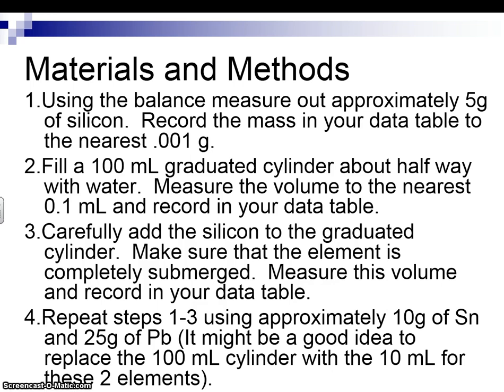Once you have completed doing all the measurements for one type of metal, then you can go up and collect your second type of metal and repeat the entire procedure again. Again, remember to return it to the correct spot in the wet samples, not the originals, and in the correct place. Then you can go back and get your third sample and do it all over again.